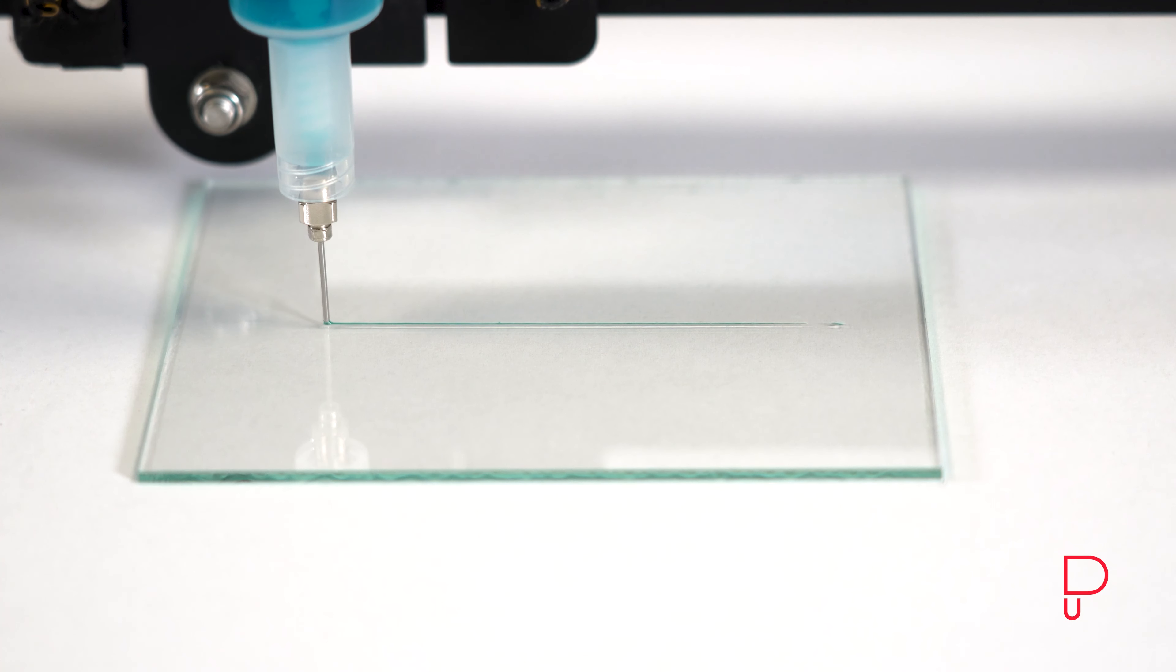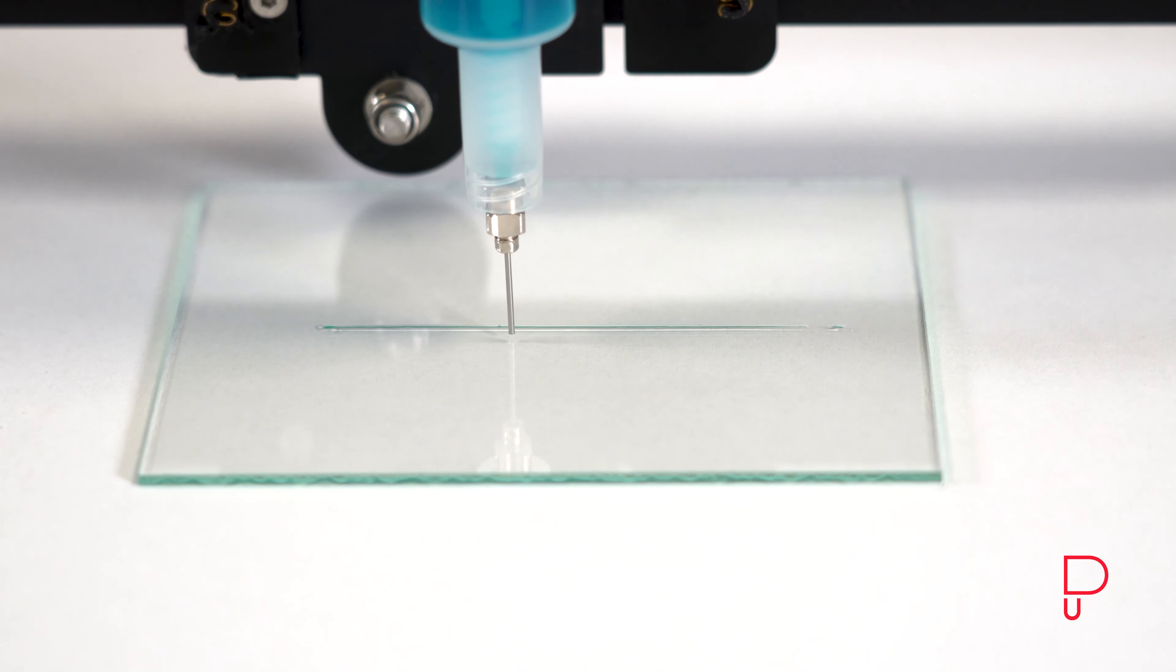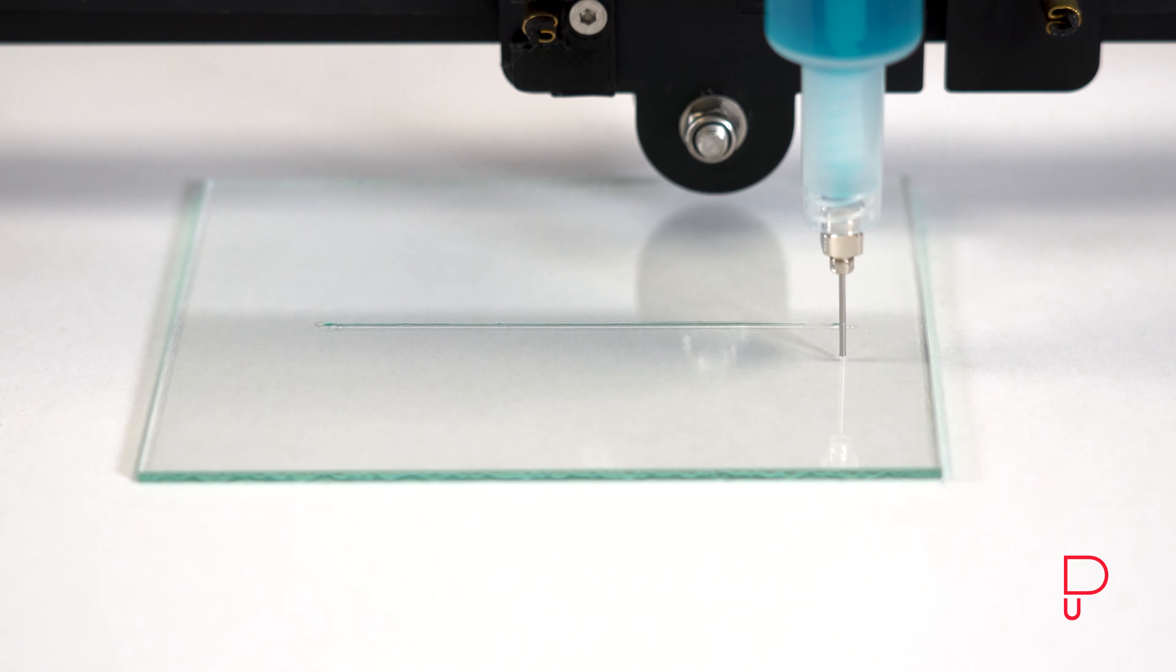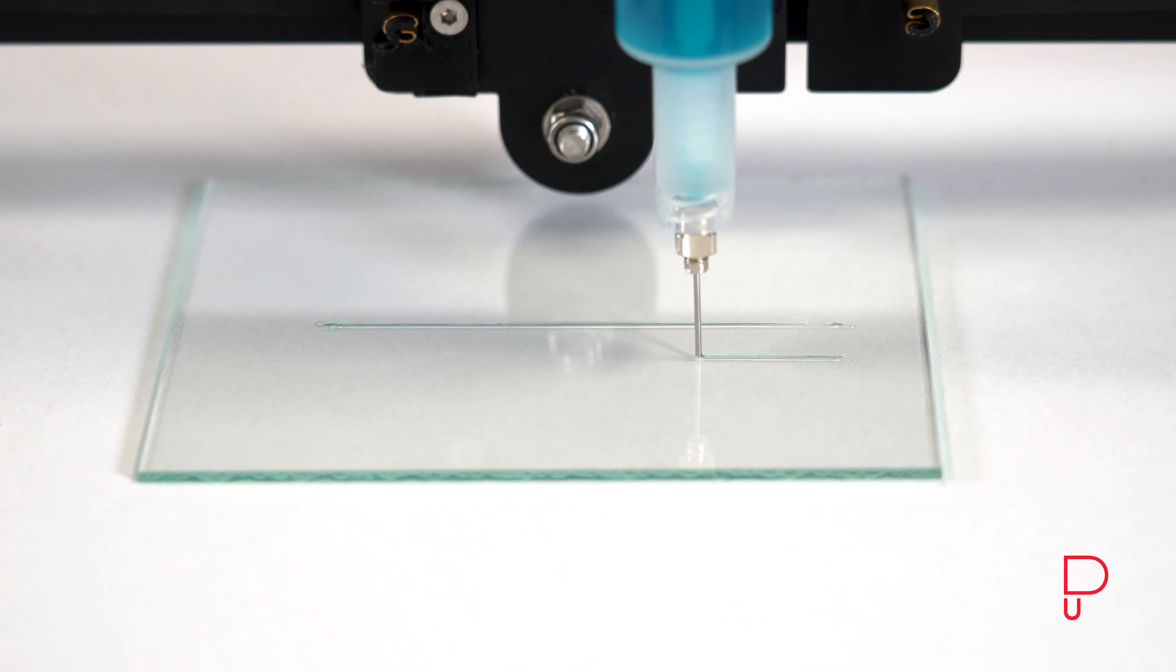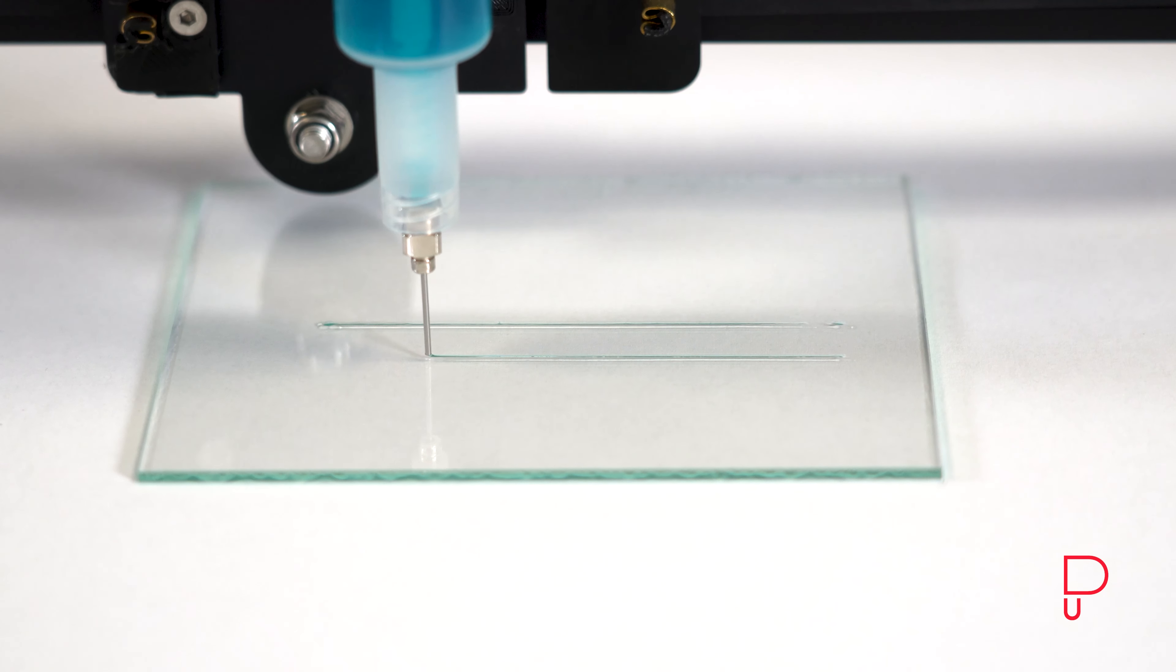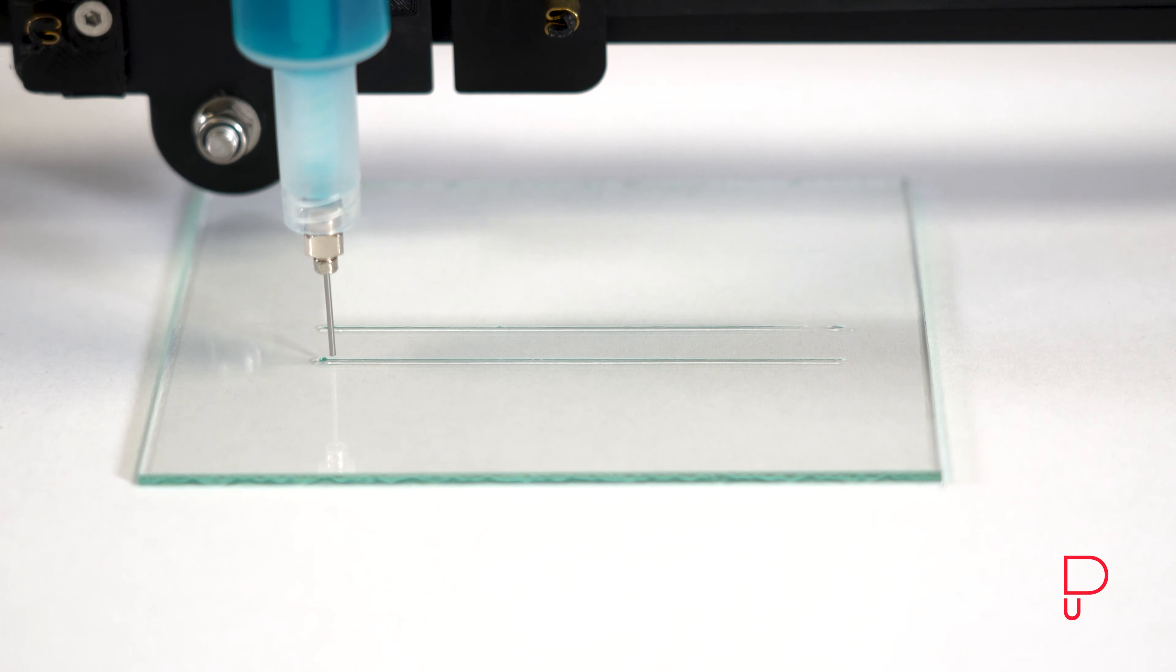The Pure Dyne brand represents progressive thinking and precision dispensing. The overriding aim is to create products for the simplest, cleanest, and fastest solution of viscous fluids.